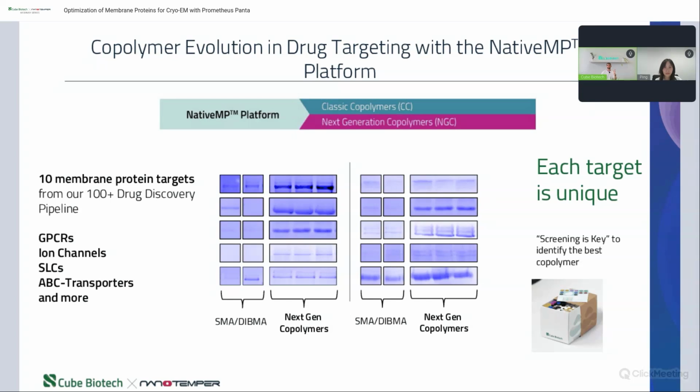So we really emphasize that you should do the screening. It's not a marketing stunt. We really do it in the lab, and it really shows that screening is key, as I always say. So yeah, as you pointed out, Ping, for cryo-EM we still need a binder or size-increasing tech to reach this effective size threshold, but otherwise we're really well set. Yes. And this is why early screening followed by scaling up and polishing is the ideal strategy. It lets you move forward with confidence, knowing your sample is both stable and suitable for the next step.